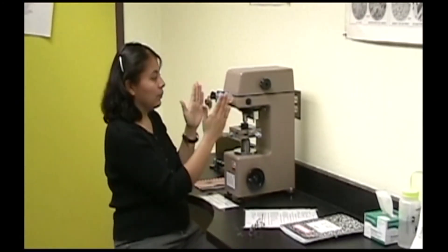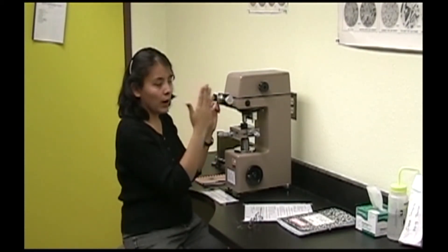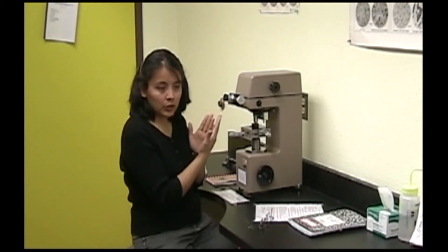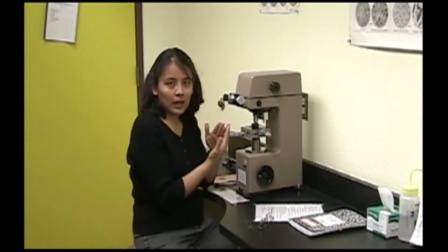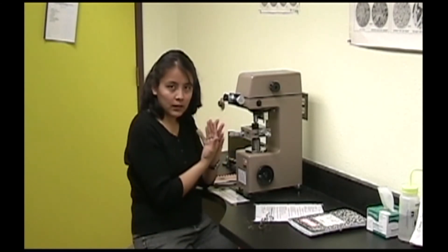You can move both crosshairs by adjusting this knob, and you can move the right one by adjusting this other knob. Never move the crosshairs too close to each other because they are painted on glass sleeves on the same plane — if you move them past each other, they can break.